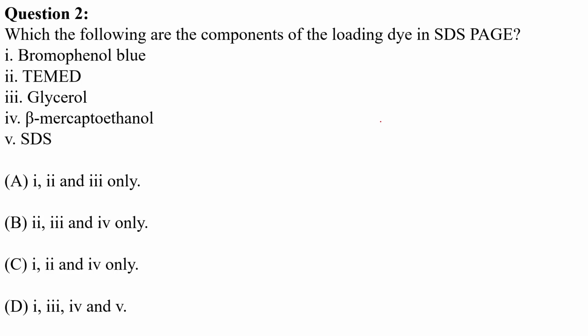So, the loading dye, basically the well that I've talked about in the previous slide, that well will have samples and the loading dye will be loaded with the sample. So, we will mix our sample, loading dye plus our protein. So we will always prepare the sample with the loading dye. What will this loading dye do?